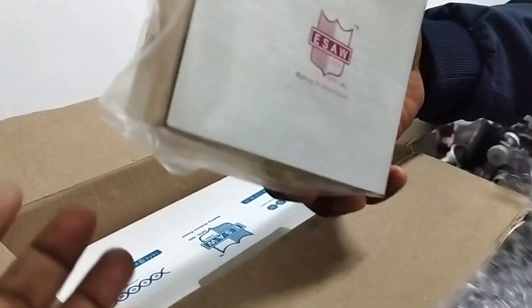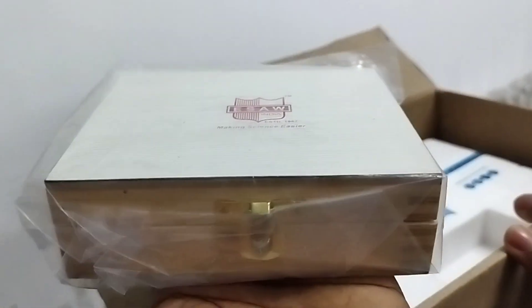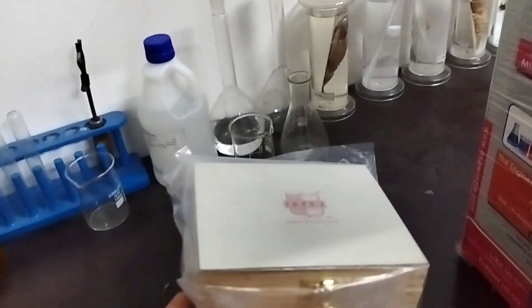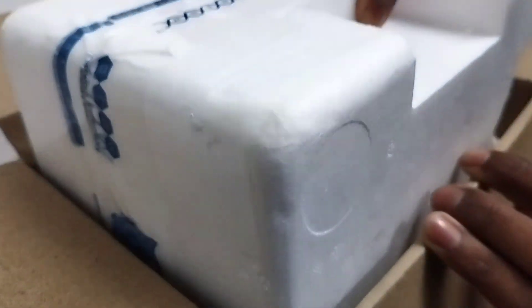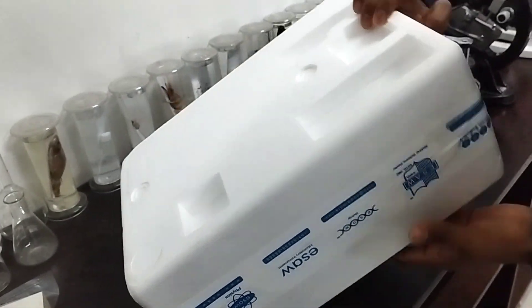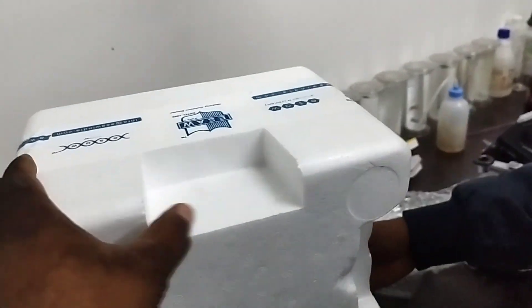There is an extra box they have given — I think there are permanent slides inside, we will open it later. Let's keep that aside and open the main box. It is thermocol packed, totally secured. Let's open it.